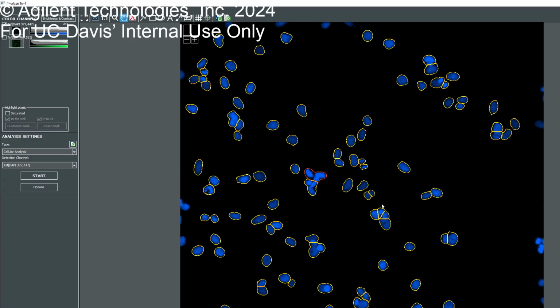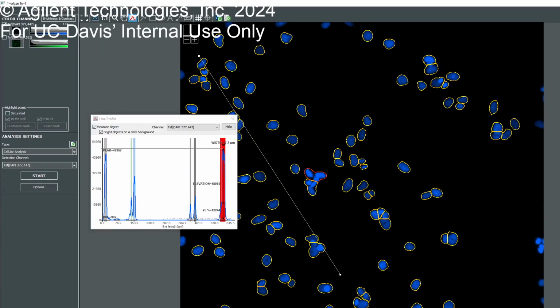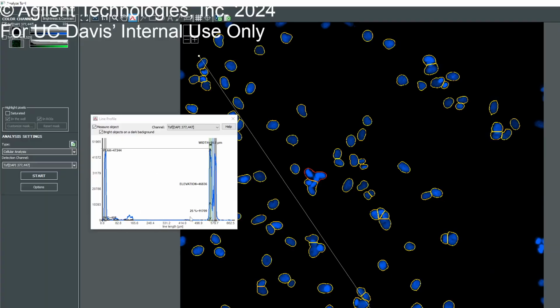Okay. Makes sense? Got it. It's an average of all. Yeah. So we have to be cognizant about everything that's happening in the image. And again, you can just draw a line like this, use the 25% number from there, and it's going to be a perfect starting point. And then in case you need to optimize something else, then you can. But in most cases, you don't.